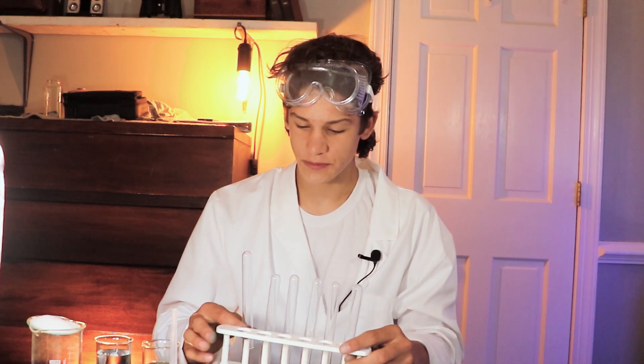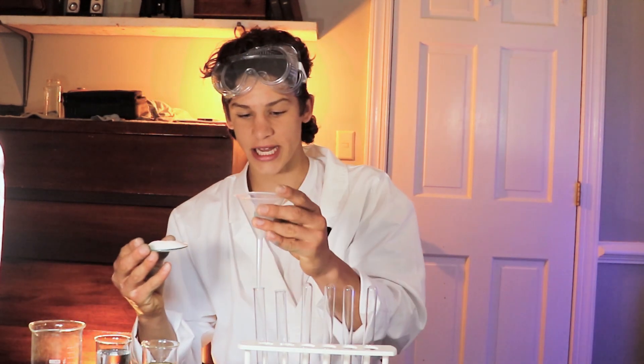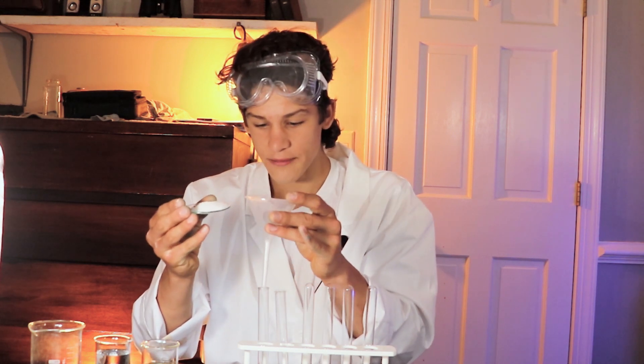Once you've collected your supplies, we're ready to get into the experiment. The first step is to take two of your test tubes and set them up straight — I'm using this handy test tube holder. After you do that, take your table salt and, using your funnel so you don't spill any, put just enough table salt in to cover the bottom of each test tube. You don't need a lot. Put it in both test tubes.